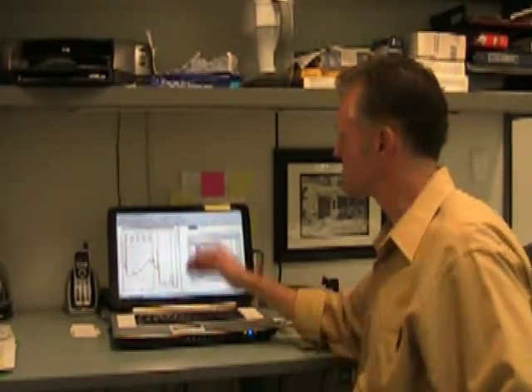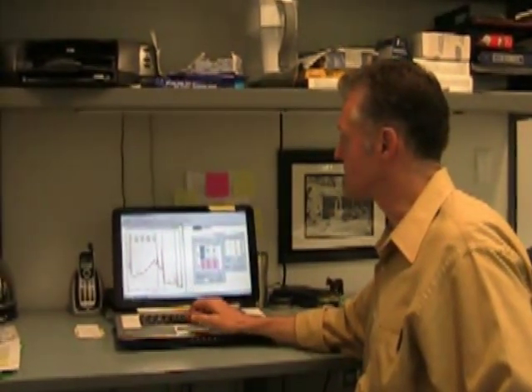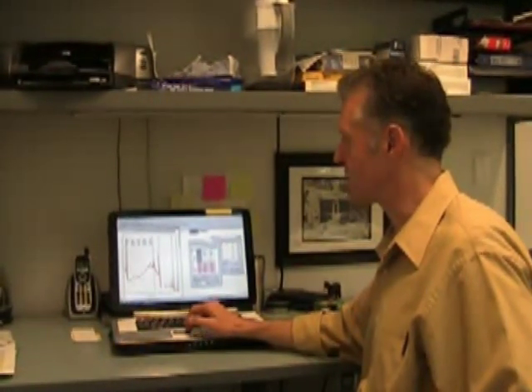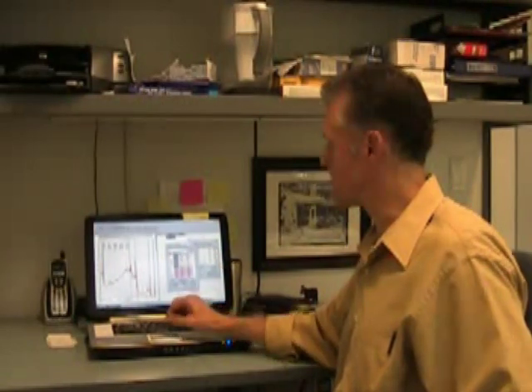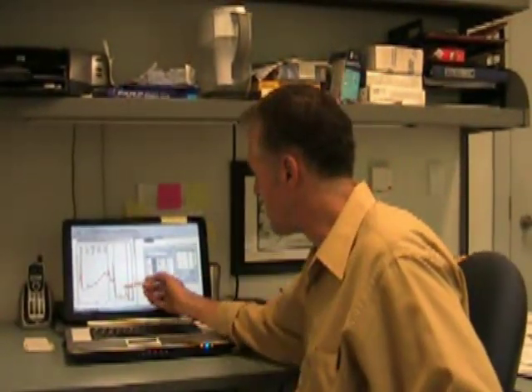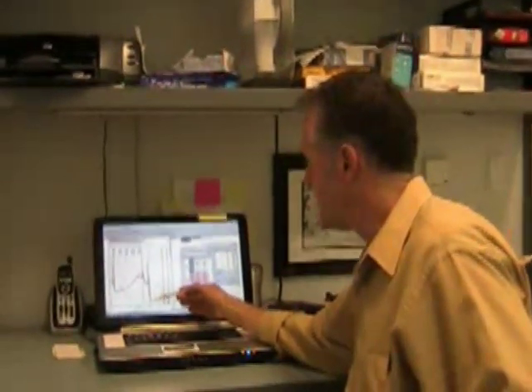So what we have here is our survey scan that we took initially. This was again just to show us what elements are there and in what amounts. What we find is the surface is composed of three elements: gallium, nitrogen, and oxygen. It's gallium nitride. It should only be gallium and nitrogen, but of course anything that's been environmentally exposed is going to have a little bit of oxygen and also a little bit of carbon.